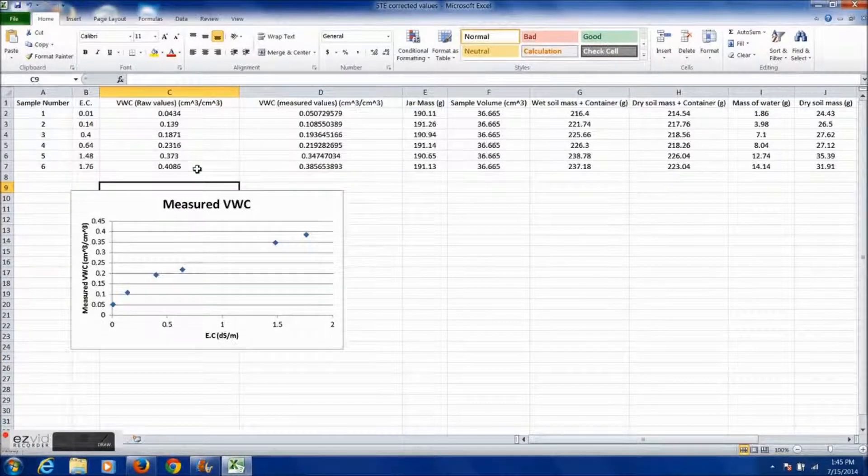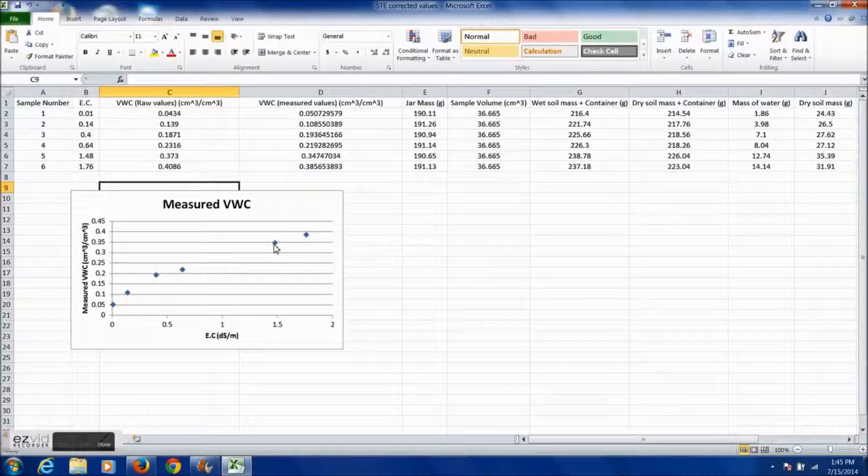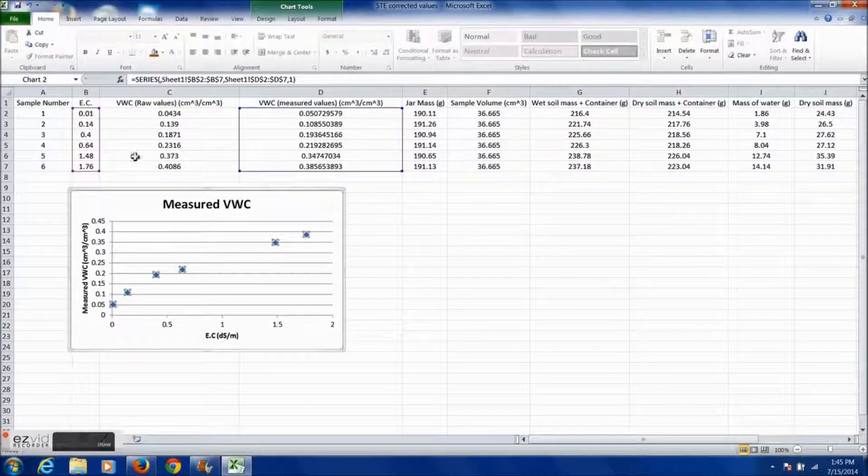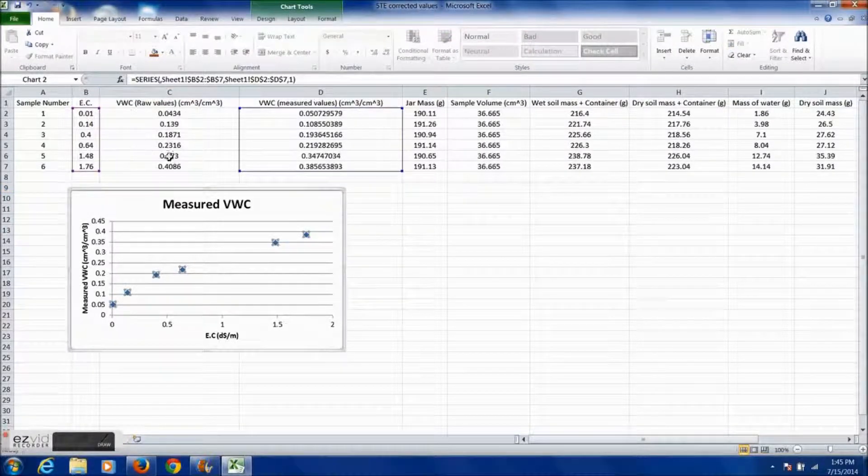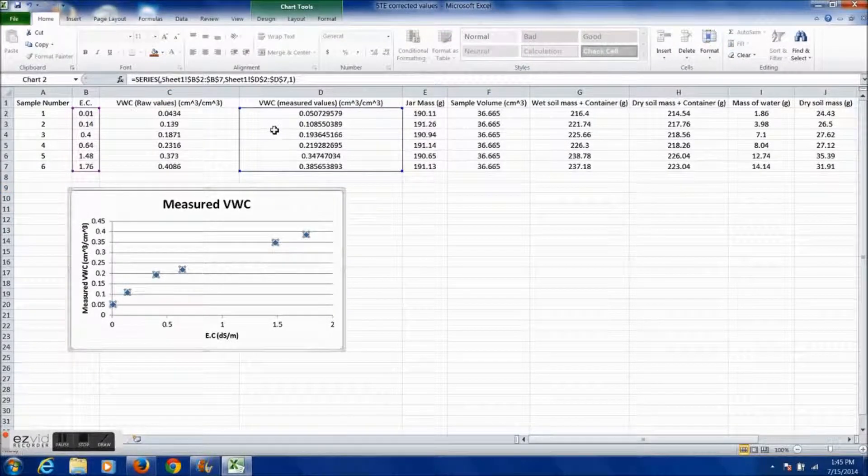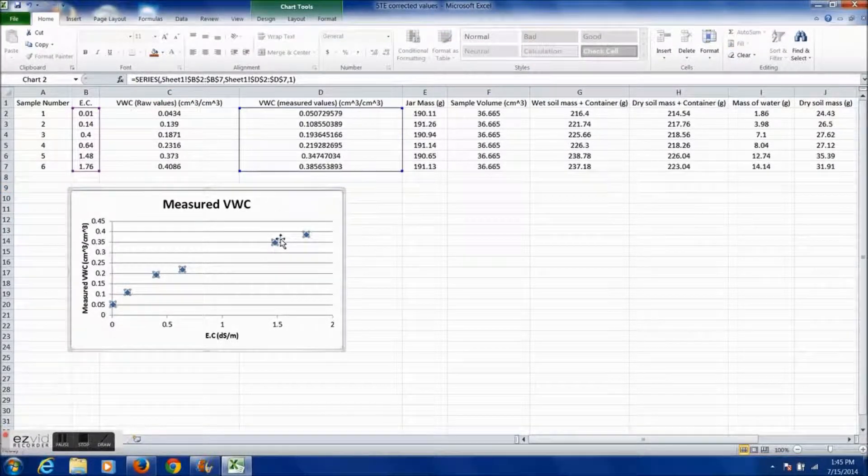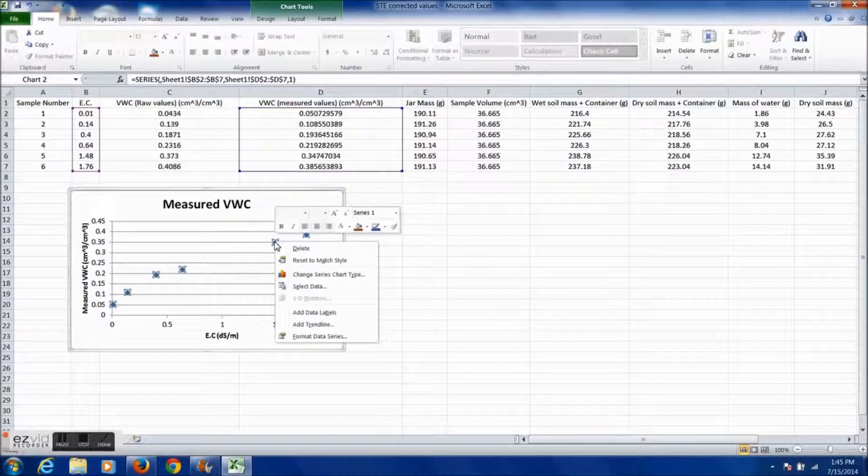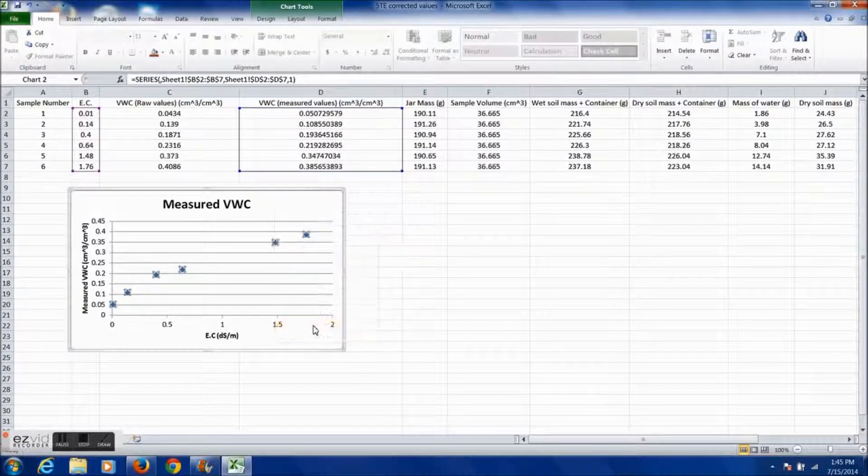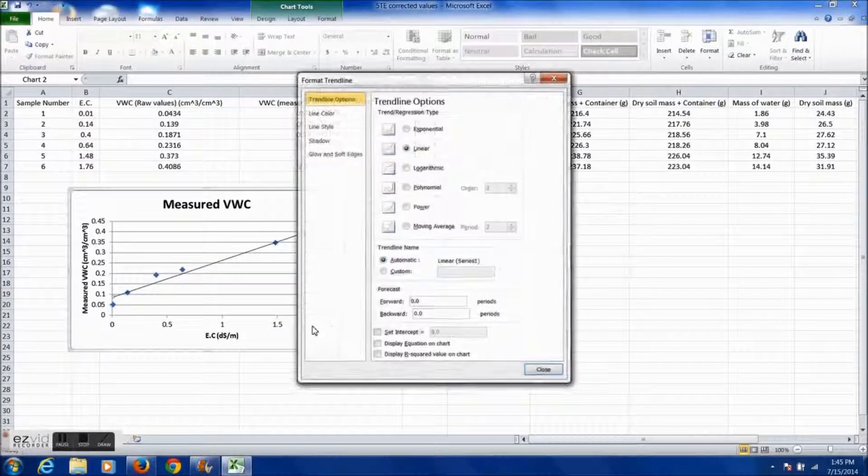When finished, plot a graph of the electrical conductivity versus the volumetric water content. Be sure to add a trendline and the equation in the options menu.